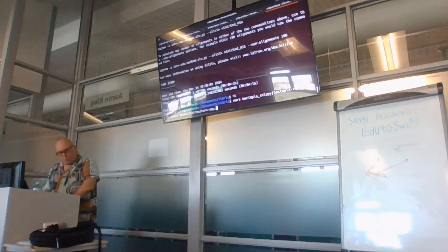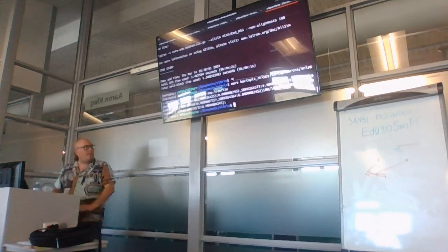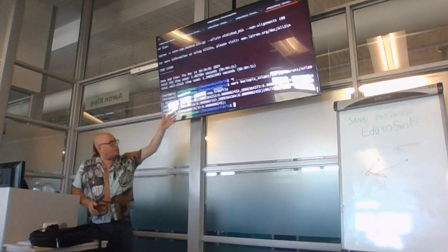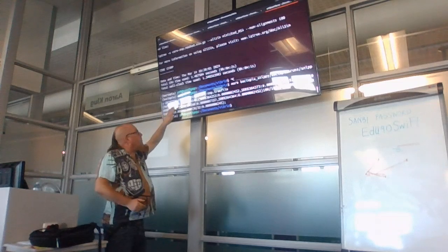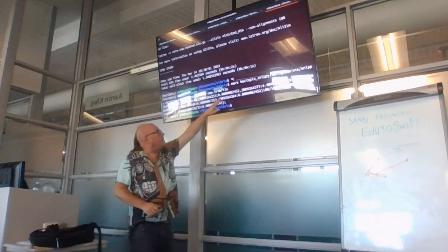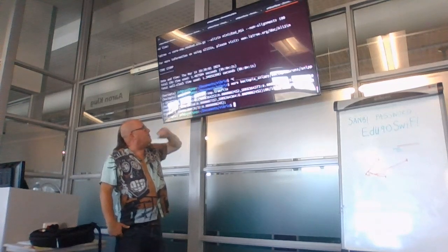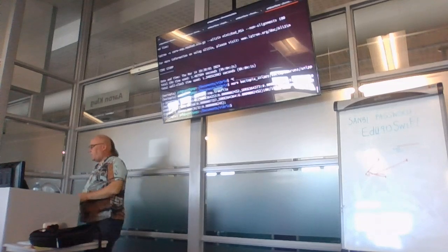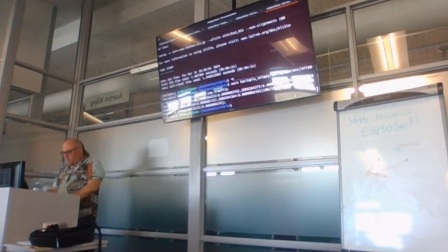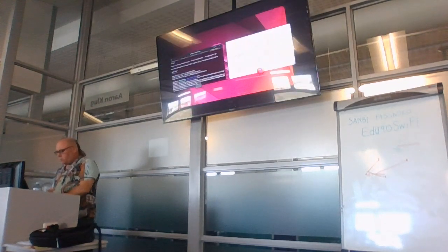So if we look at the tree file, this is a Newick format tree, but even here it's not giving us the number of mutations. It's giving the branch lengths according to some scale, where these numbers must relate to the number of mutations somehow, but I'm not quite sure how. But that's why I wanted to switch to RStudio.